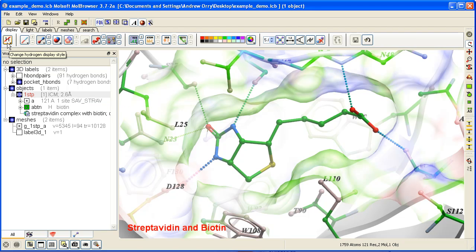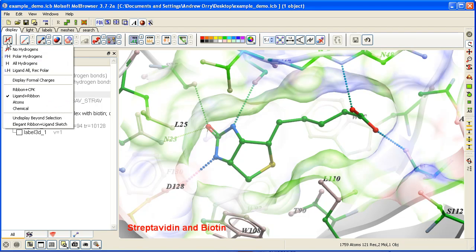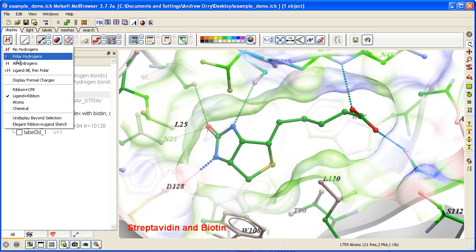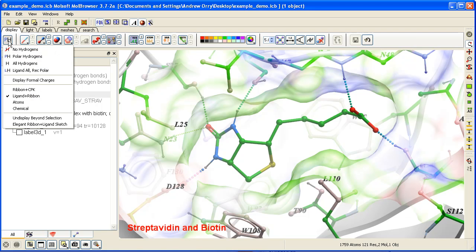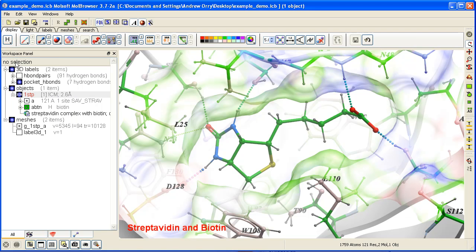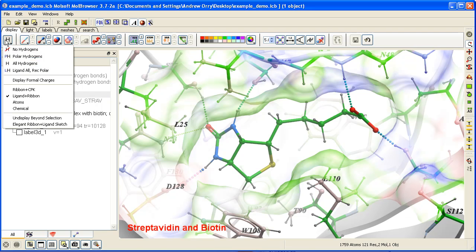Here we have the toggles for the hydrogens. You can click and hold here and choose to display just polar hydrogens, all hydrogens, or all ligand hydrogens and polar hydrogens on the receptor.